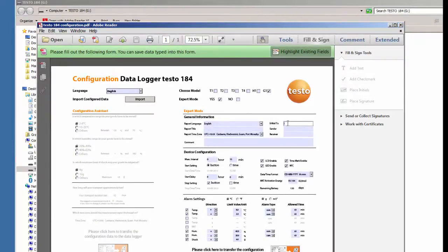We're going to enter some information in here — in this case I'm going to enter my email address, and I could put some comments here. I'm going to set the sampling interval — in this case instead of 15 minutes, to one minute — and the rest of that section I'll leave the same. Now in this alarm section I'm going to put alarms. I'll set it at about 25 degrees now.